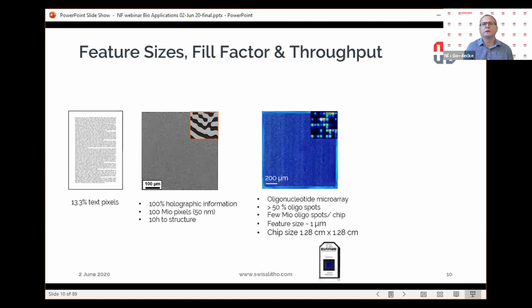For example, if you go to an oligonucleotide microarray or gene chip today, you find that those chips are also highly dense packed, but they are often more spaced apart from each other. Unfortunately, the manufacturers nowadays don't boast too much about their microfabrication anymore. They used to show all the details, so I put together what I could find out.